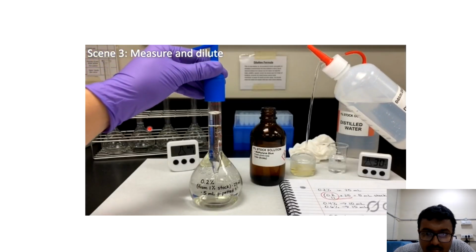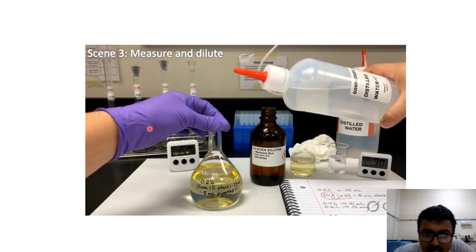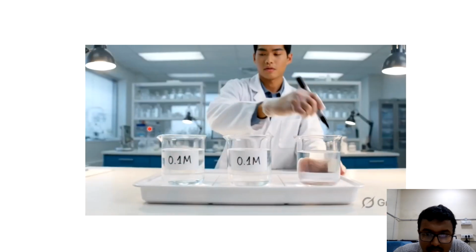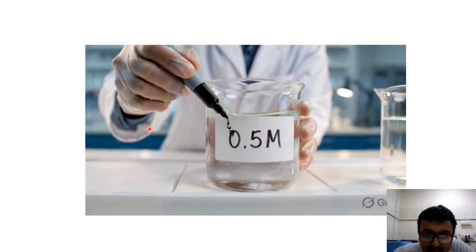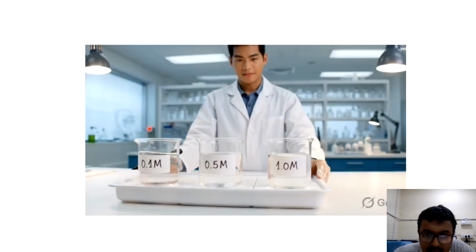First, draw up 5 milliliters of the stock solution. Now, dispense it into the volumetric flask. Rinse the pipette with distilled water. Swirl the flask to mix the solution. Marking this one as 0.1. Next, 0.5 and 1.0. All labeled and organized, ready for the experiment.